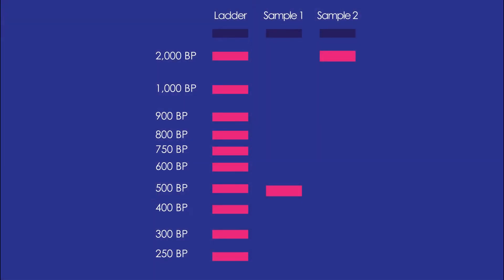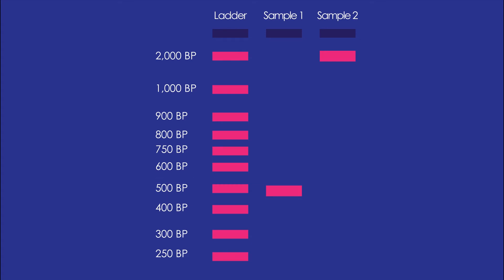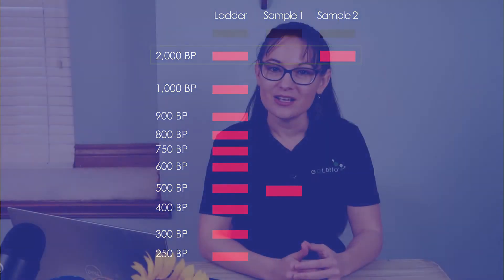So if we compare sample one, which is in lane two, to the ladder, we see that sample one is about 500 base pairs. But if we compare sample two with our ladder, we see that sample two is roughly 2,000 base pairs.